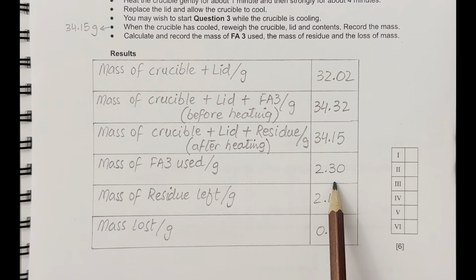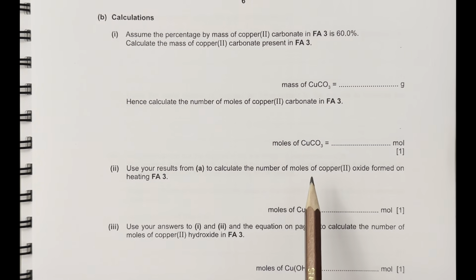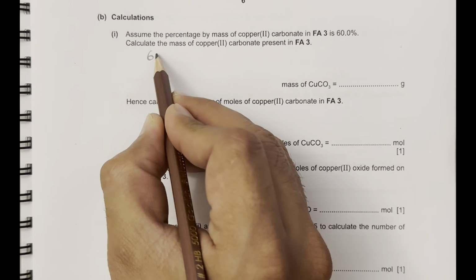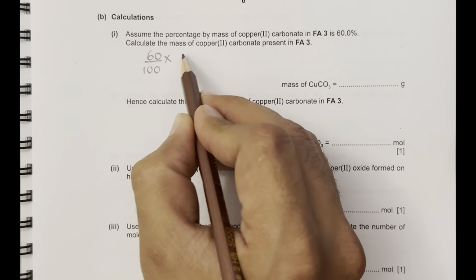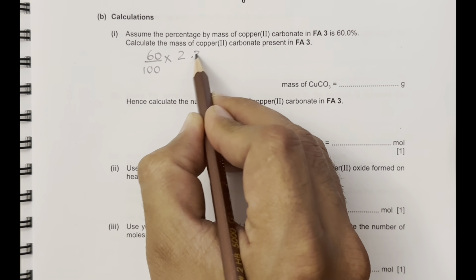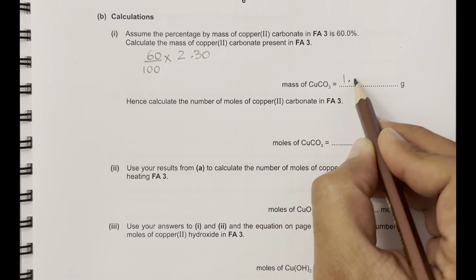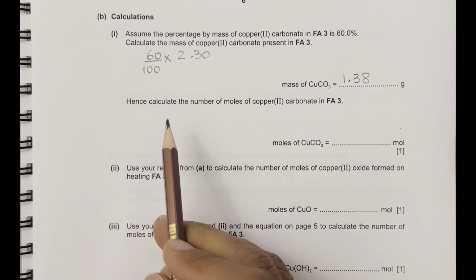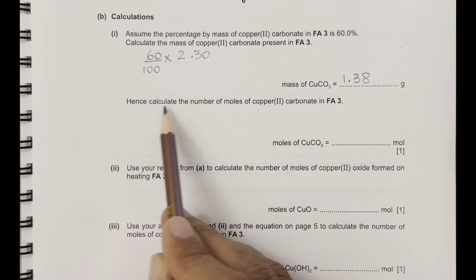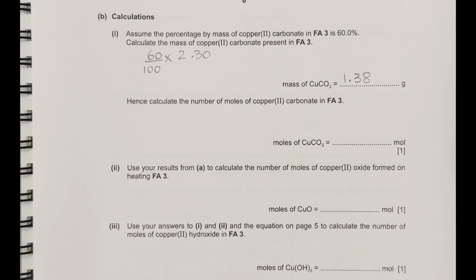If you want to calculate 60% of this, we take 60% of FA3, which is 2.30. So the mass here will be 1.38 grams.